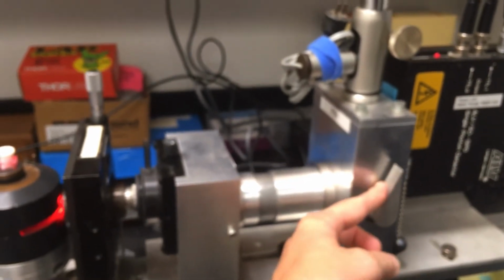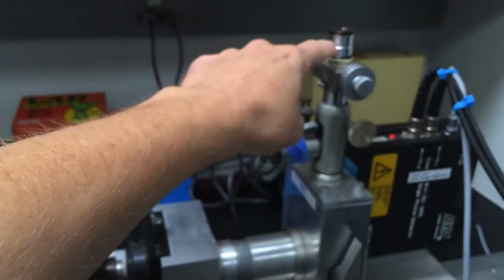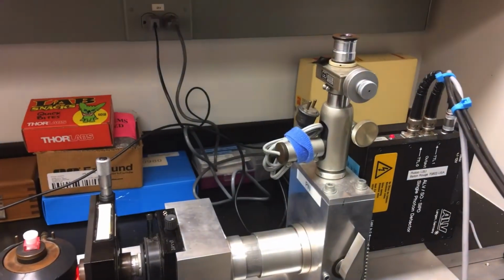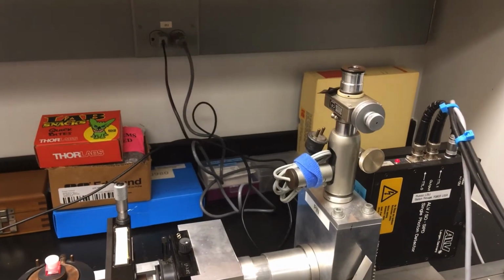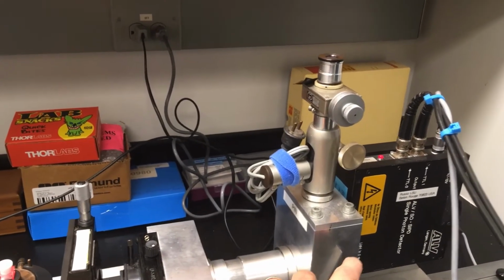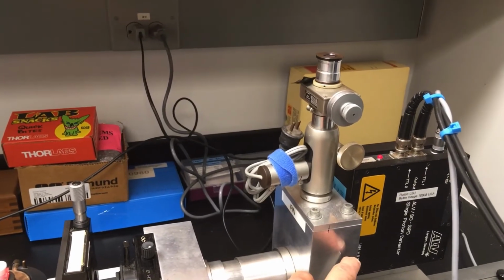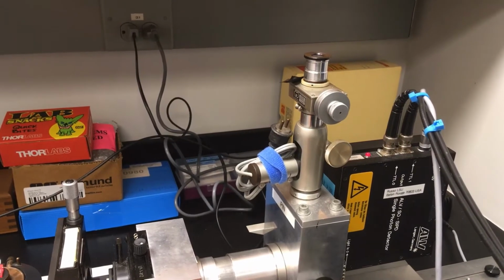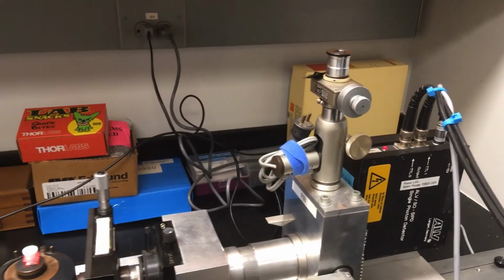Currently, the signal is going to the detector. If I was to lift this up, then the signal would go to the eyepiece here, and you're going to have to trust me on this. You could look in there now with your eye and not ruin your eye, because the polarizers are capturing all of it. The amount of depolarized signal is small.